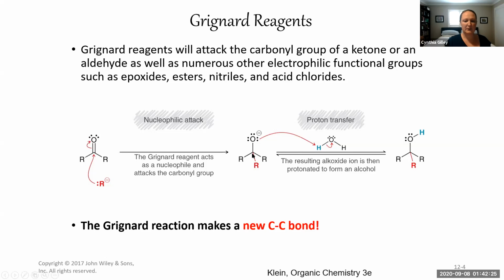At the very end of the reaction, there will be what's called a quench. That's when water is introduced, or aqueous acid. And one of the functions of that is to protonate the negatively charged oxygen to make the OH group, which is a neutral and isolatable functional group.